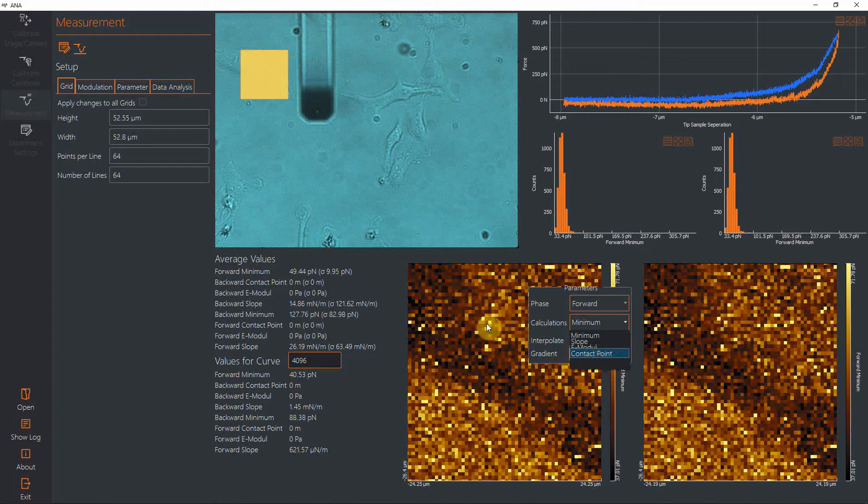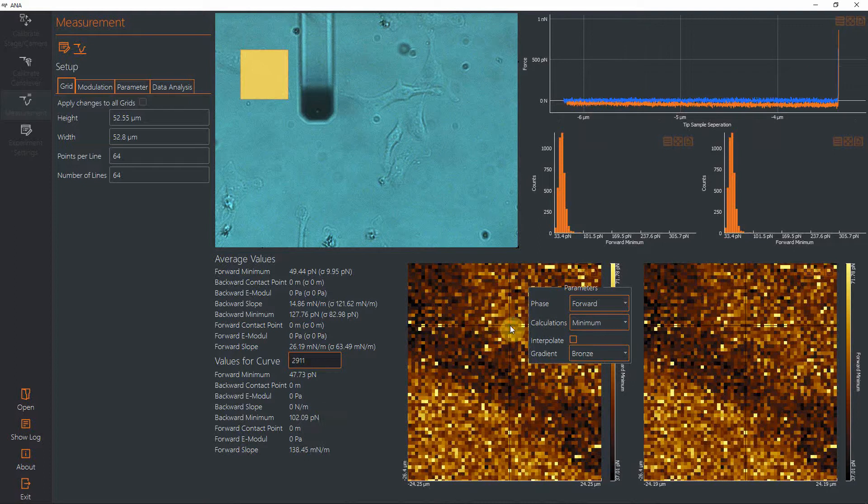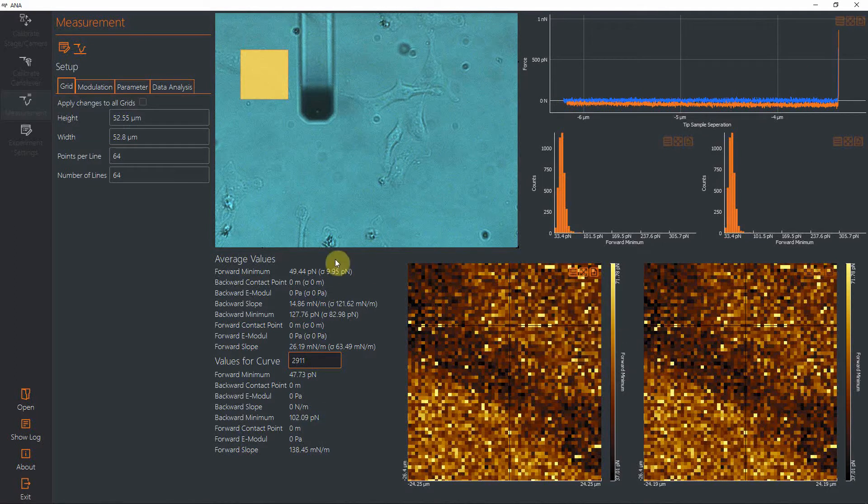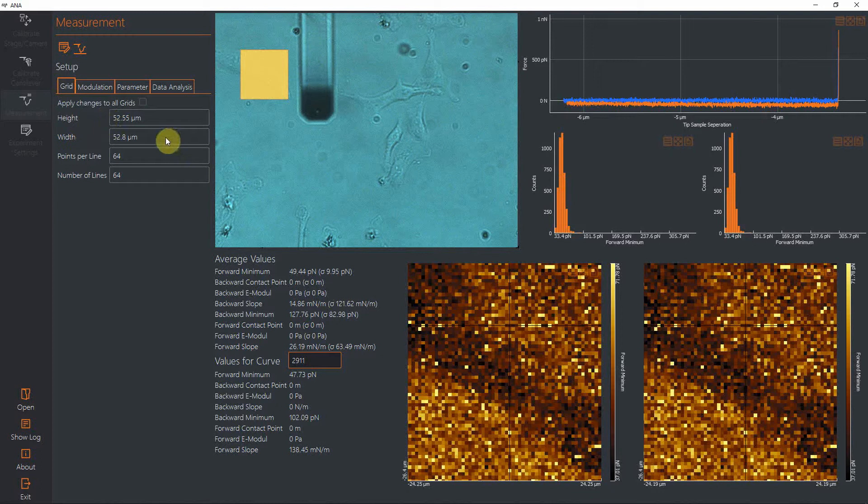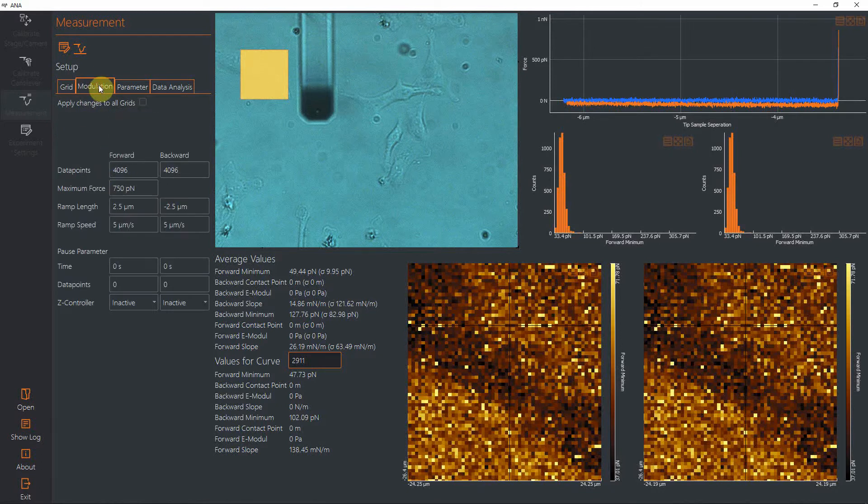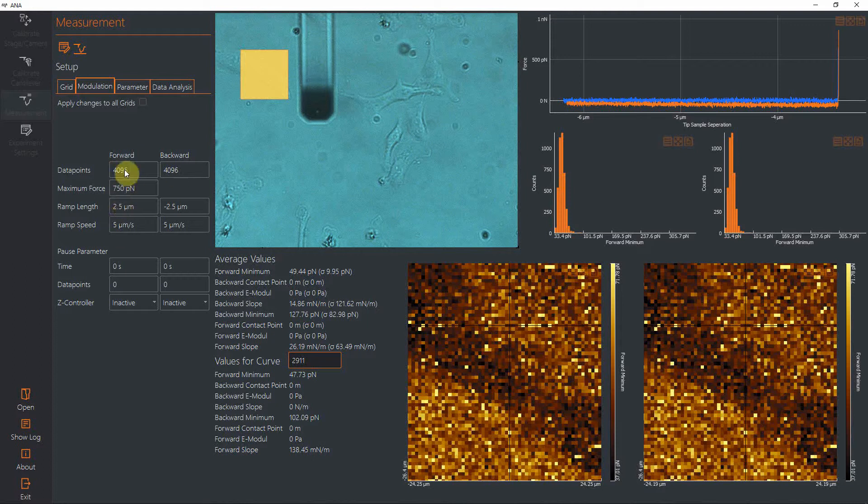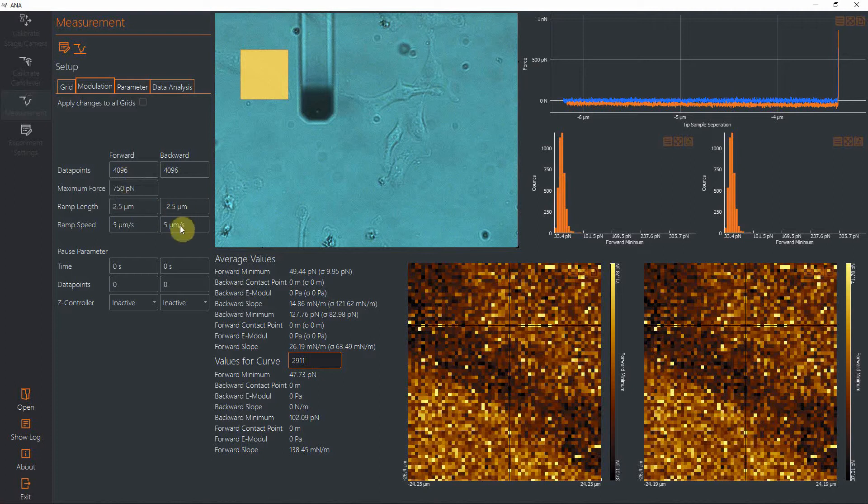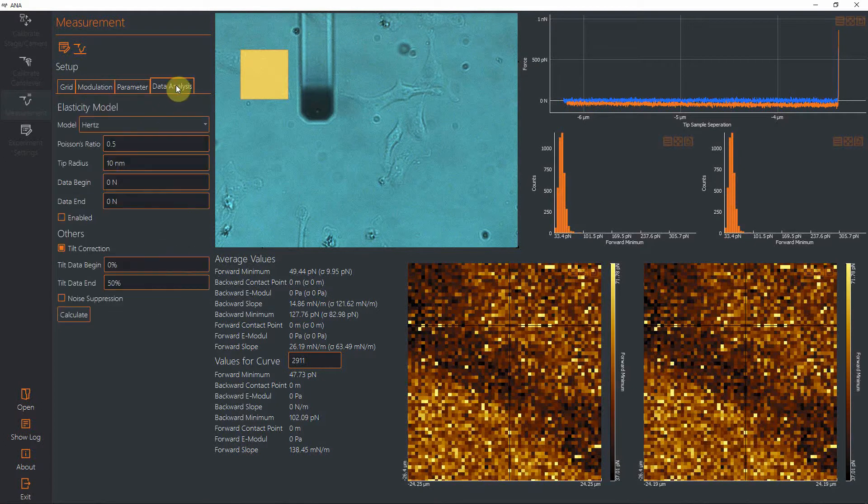If you activate later or if you activate 'calculate the elastic modulus,' you could also display the modulus and the contact point coming from the modulus calculation. In the grid tab, you can see how big your map was physically and how many points you recorded within that map. In the modulation tab, you can look at how many data points per curve you were having, what your maximum force was, the ramp length, how fast you were moving, and if you had a pause.